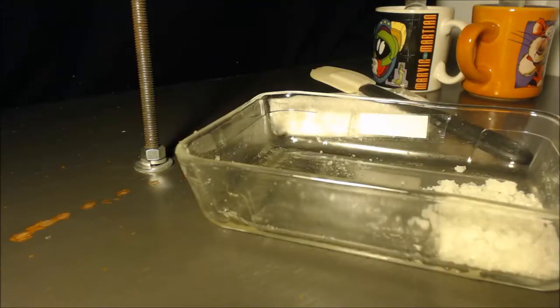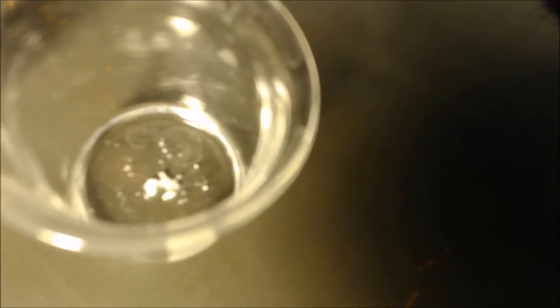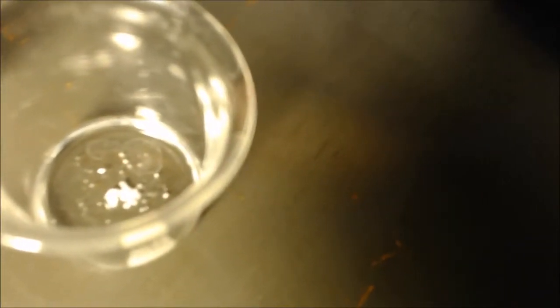It's all liquid anyways. First, let's see what it does in some acid, because if it's no carbonate, then there's going to be no fizzing. It's just acetate, you know what I mean? No fizzing. Yeah, there's some fizzing there. Just a little bit though. And throw a big clump in.